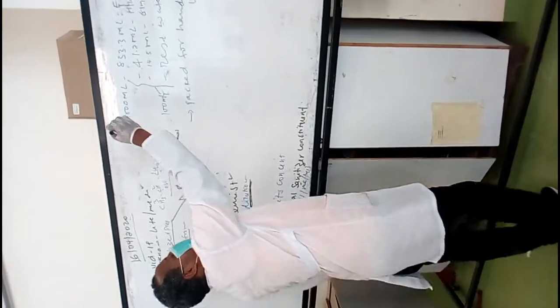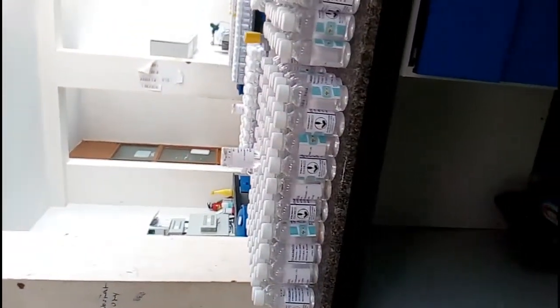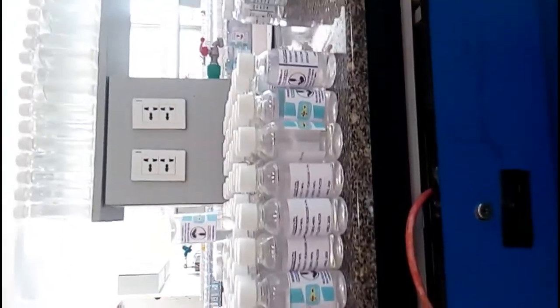And in general, according to WHO, we prepare the sanitizer in the lab in our university. In our university, we are preparing sanitizer and distributing it to the society. How can we prepare this hand sanitizer according to the WHO?